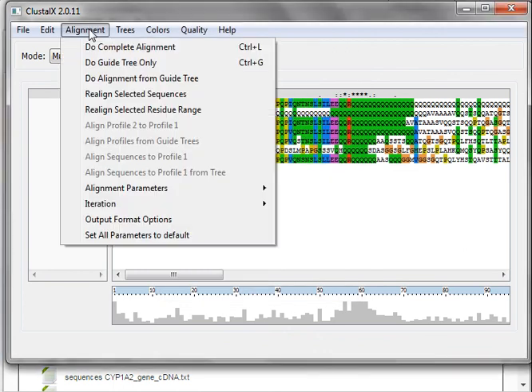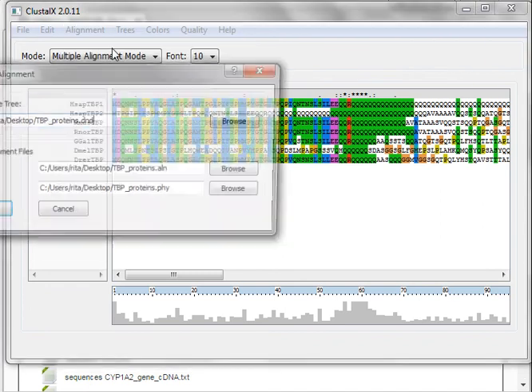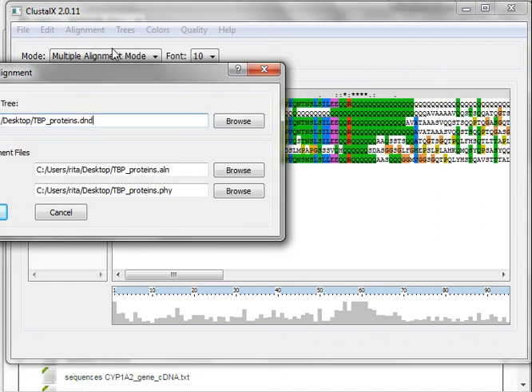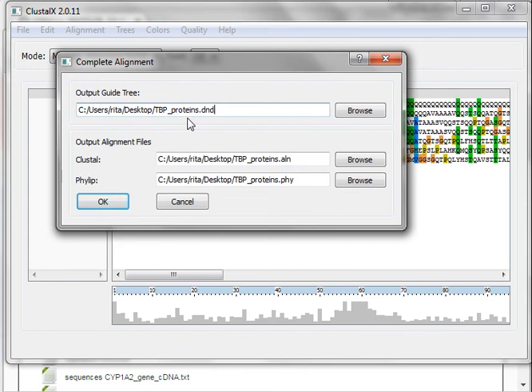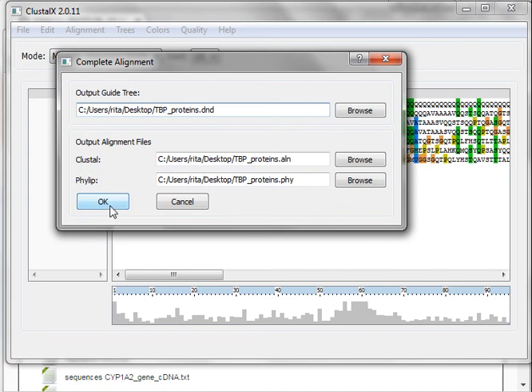And now you will really perform the multiple alignment. It will save your sequences in the same place you went to pick up your FASTA format sequences. And then it saves an ALN Clustal style format and a PHY in the same place. If you want to change it, you can change it. Otherwise, you lose it. And you need to know exactly where this file is to follow up to phylogeny.